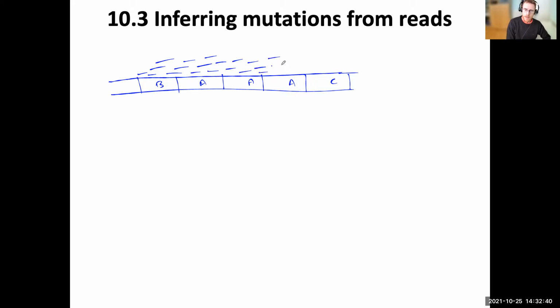So if A is amplified in our particular sample, that means we'll have reads that span from A into A here. So those particular reads will span A into A, the start and the end of A. However, there's certain reads here, like this one highlighted, and this one as well, that span B into A. So they can be uniquely mapped here. Over in this end, we have reads that span A into C and A into C here. So they give us unique types of information to resolve that particular region.